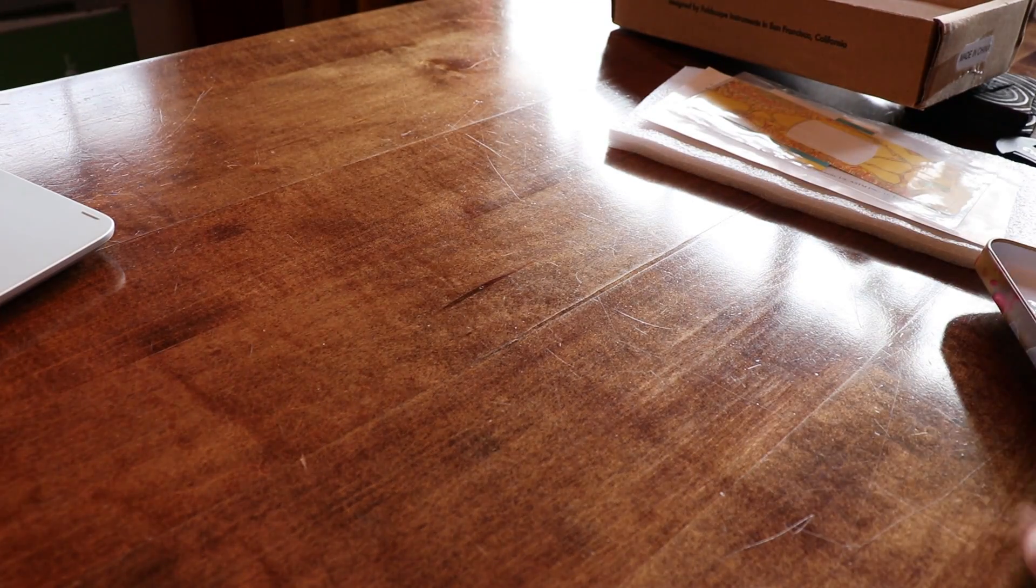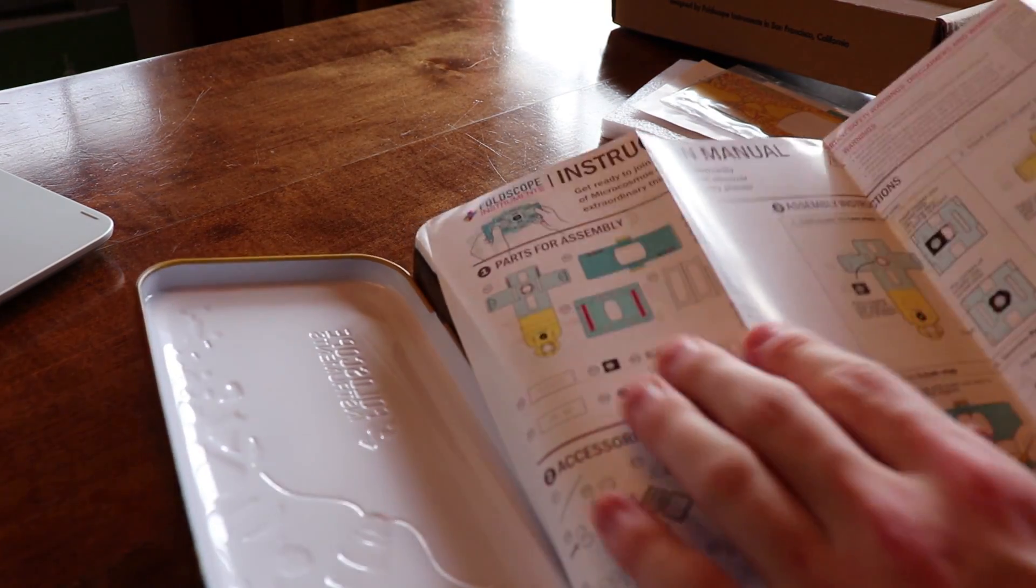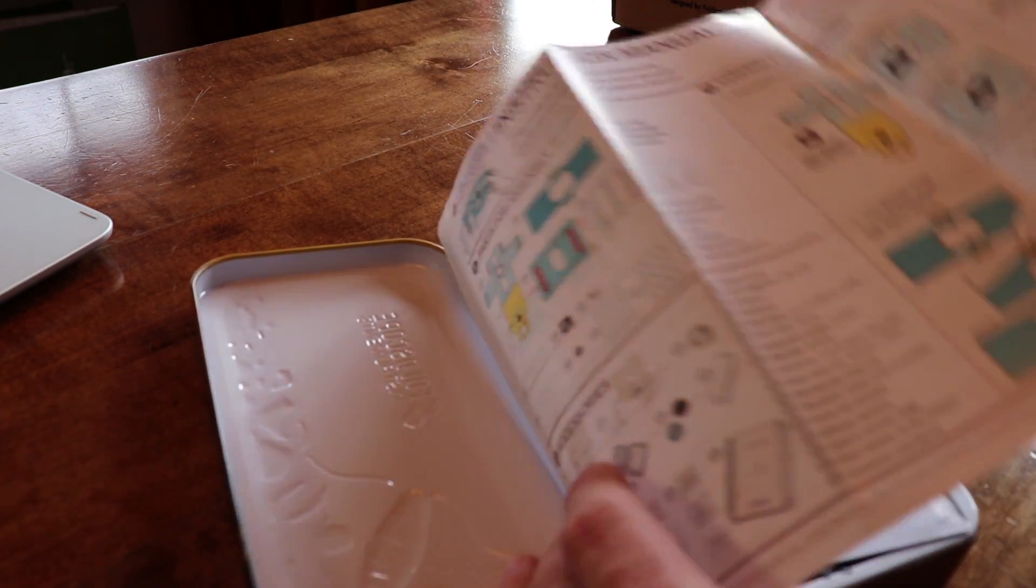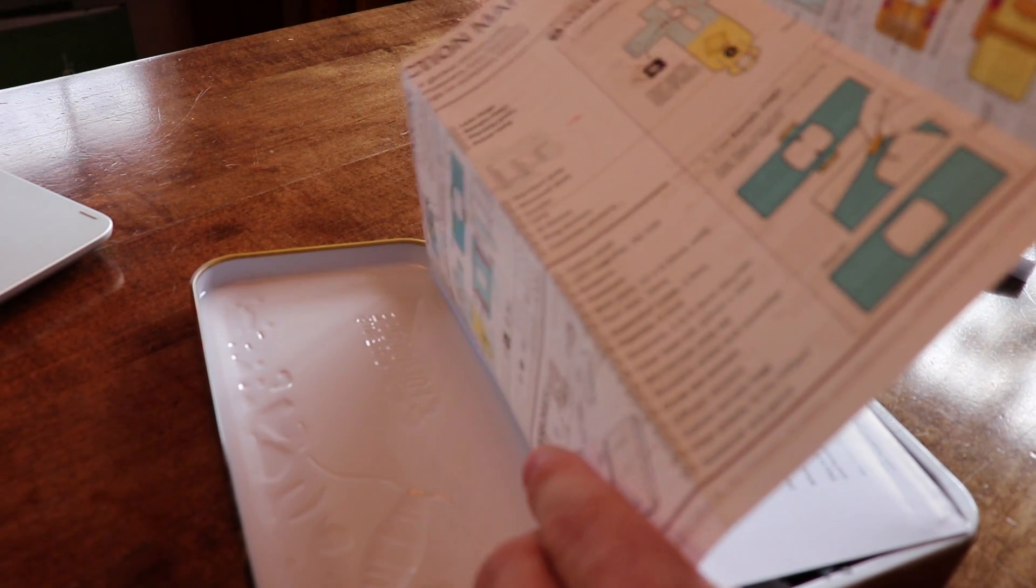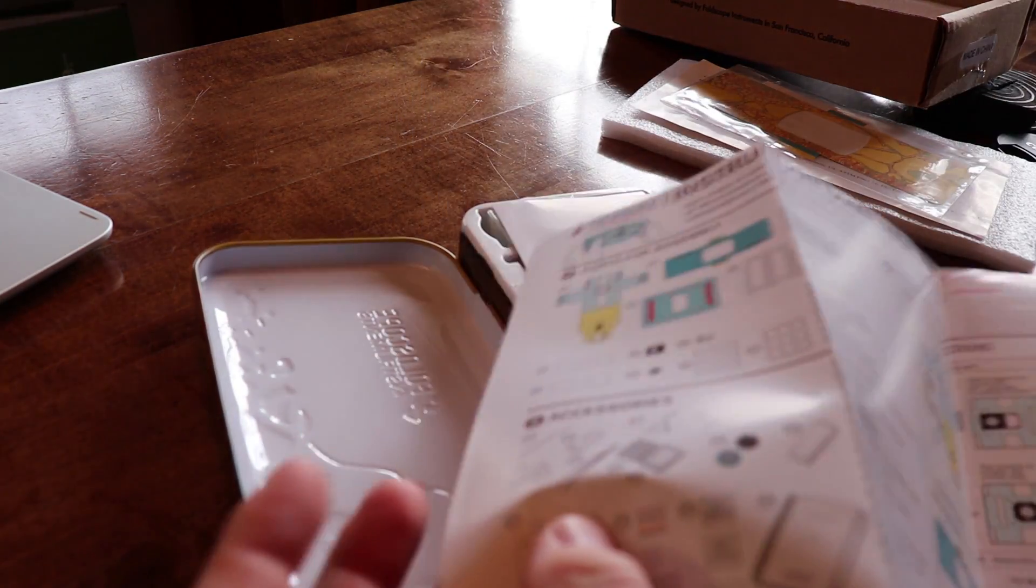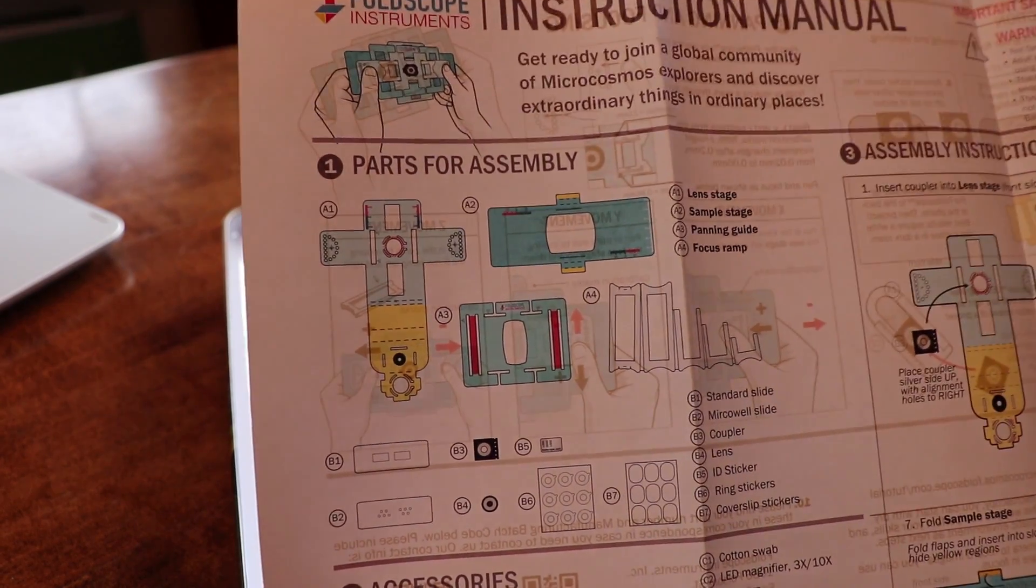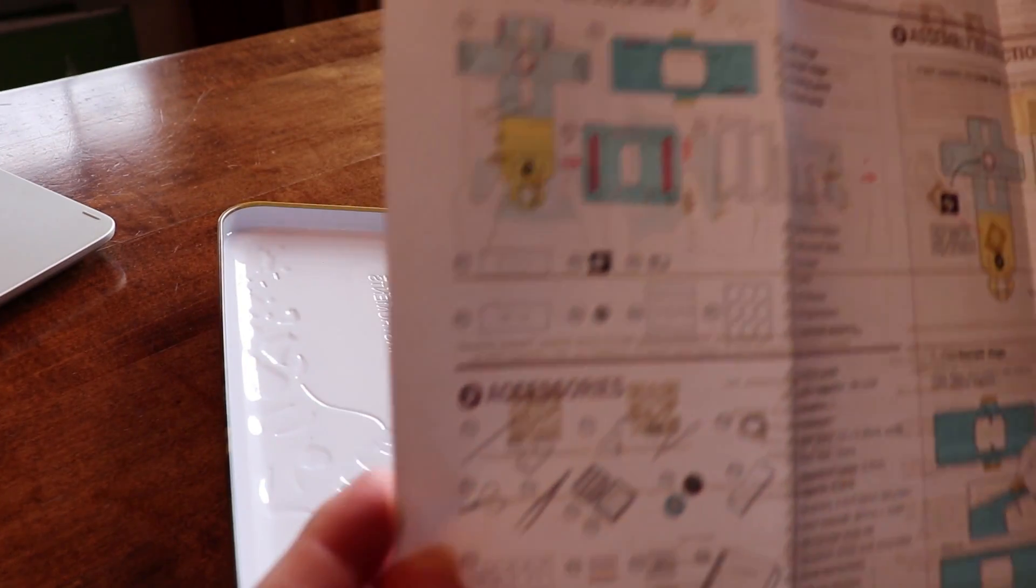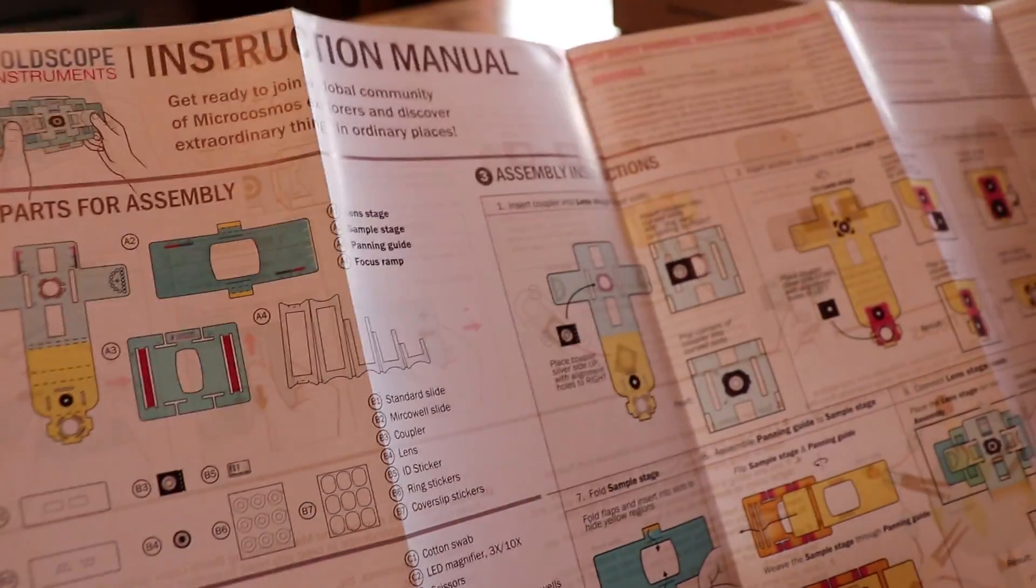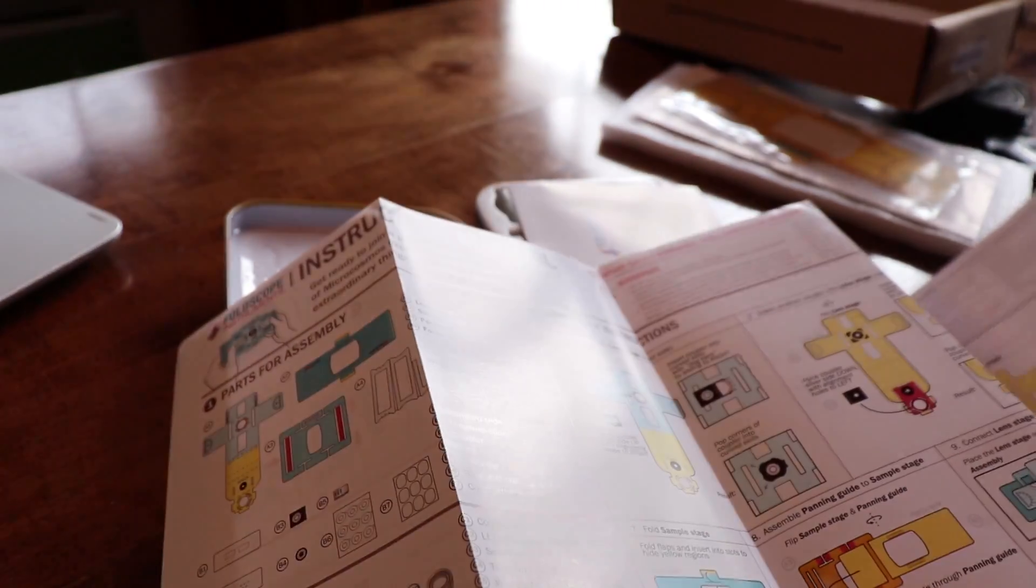We have some kind of instructions here that are stuck in the lid. So it's just this accordion folded instruction manual. Typical of what you would see. Slide mounting. Okay, so it starts here. Parts for assembly. Now this is going to have to come out for me to see it.